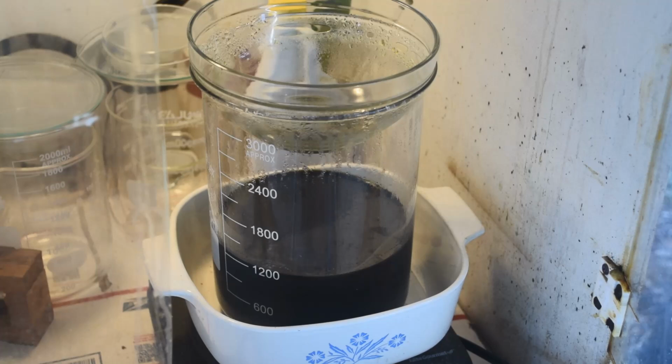And add a little acid to it. It's still got a little bit of bubble in it, but it's nothing like it was in the beginning. So I'm thinking the vast bulk of the iron has been eaten up by the acid. Probably not all of it. I imagine there's still some in there.